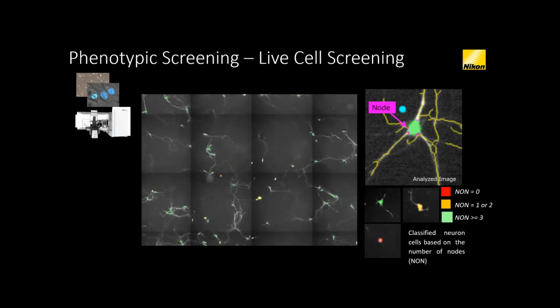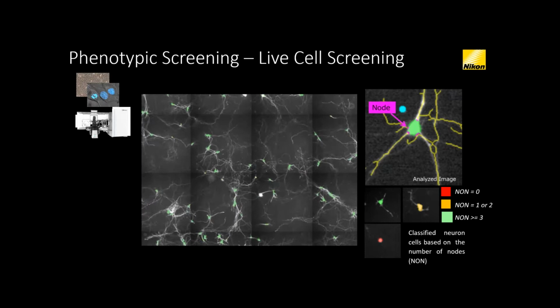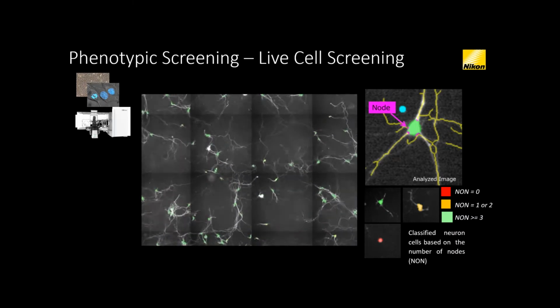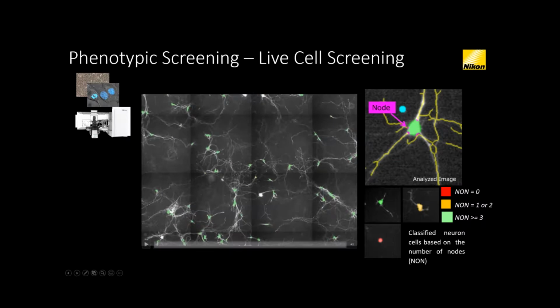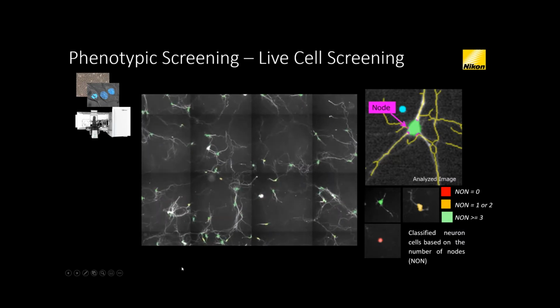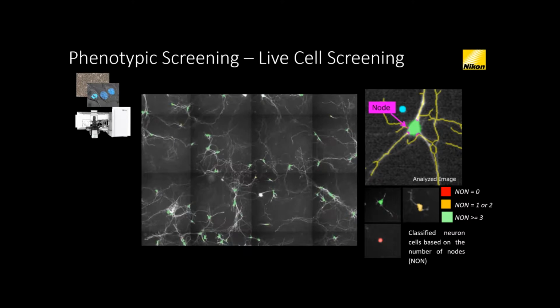So what this looks like in real life is something like this. The cells that are tagged in green have been determined to be healthy. The cells that are tagged in yellow are determined to be unhealthy. And the cells that are tagged in red are dead. Over the course of the entire imaging experiment, we can track cells that start out unhealthy. You can see they start out yellow, but then they become healthy, they become green, right? Or cells that might start out yellow and become red over time, or cells that were red and stayed red. This allows a more nuanced approach, where we can say a certain population of cells started out sick and became well, or a certain population of cells started out healthy and stayed healthy.